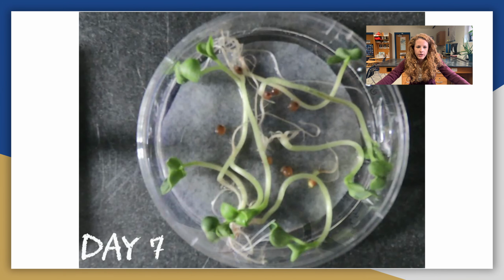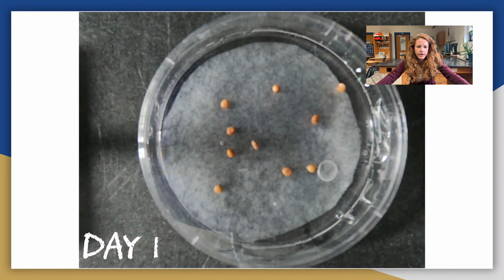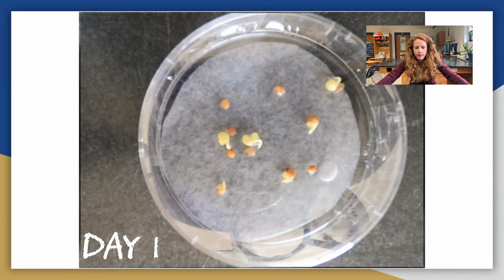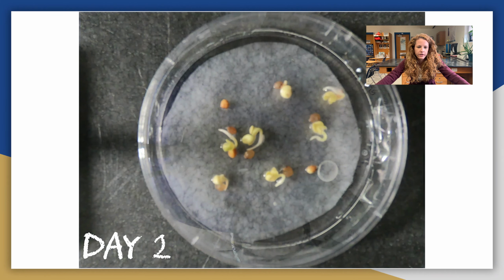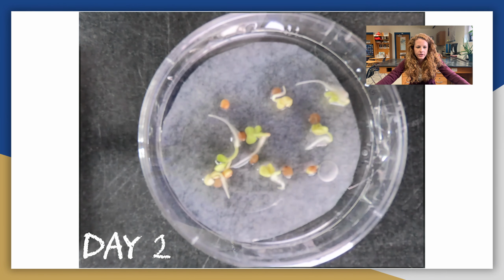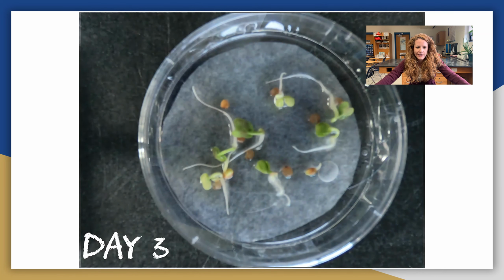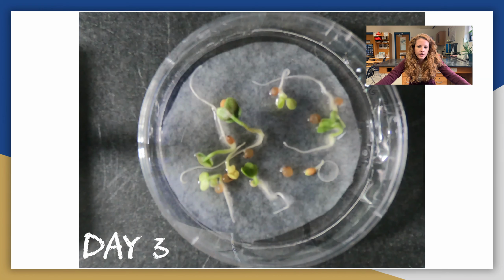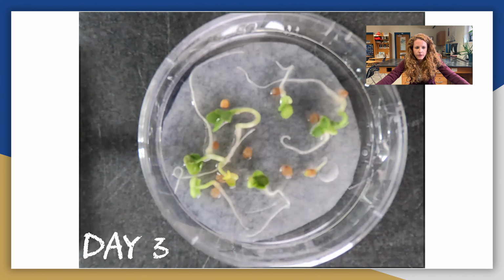So I want to show you a time lapse of the radish test. What we have here is a petri dish of 10 seeds that were grown in a concentration of salt water. Salt is toxic to the radish, and my students and April's students performed a serial dilution, meaning we started with a dish of highly concentrated salt water and then diluted the salt solution across 9 petri dishes. So by the end, you have a very small concentration of salt in your final dish.